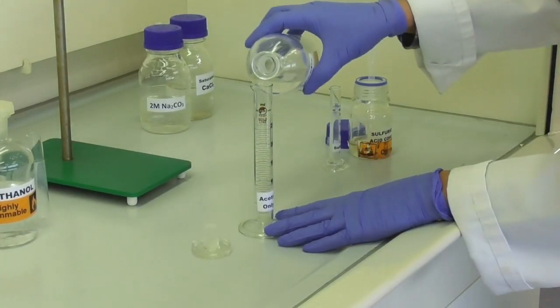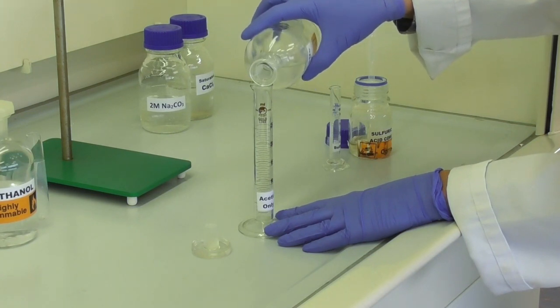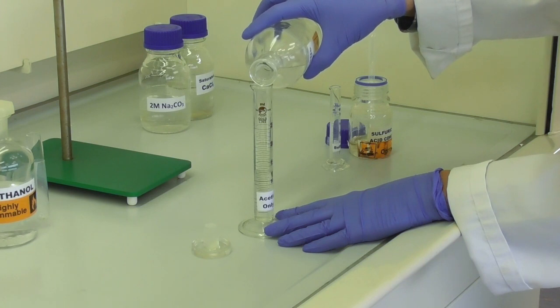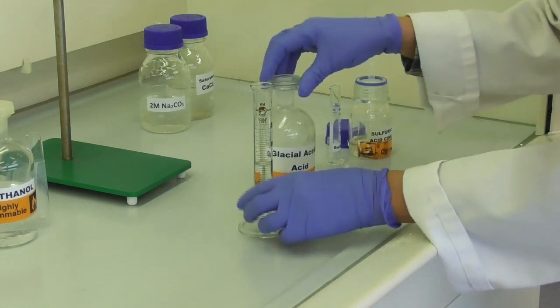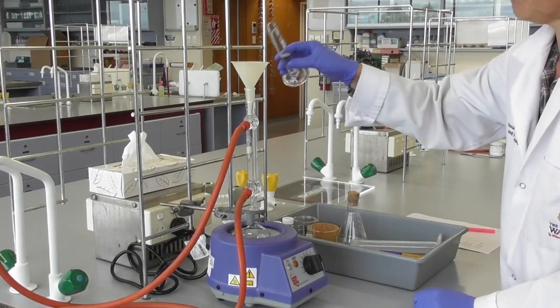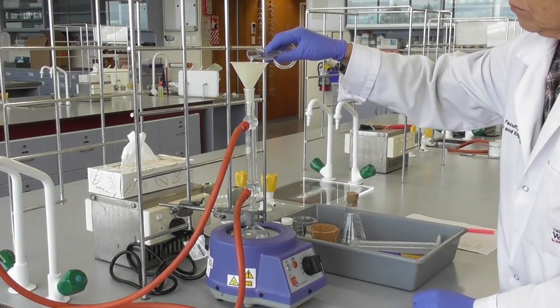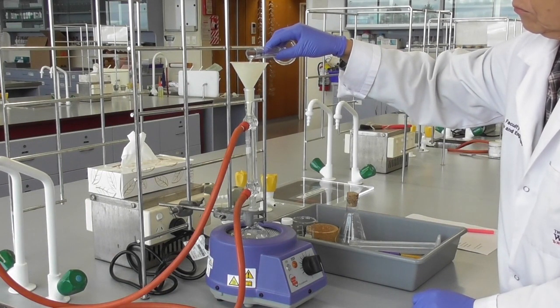Again in the fume hood, we measure out the second reagent, which is 15ml of glacial acetic acid. We take this to the apparatus and add it into the flask through the condenser.